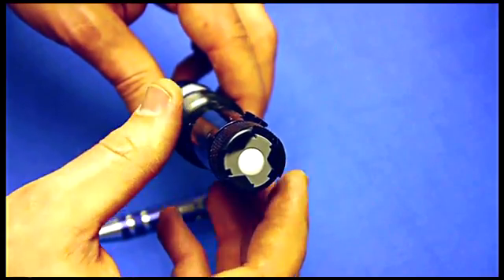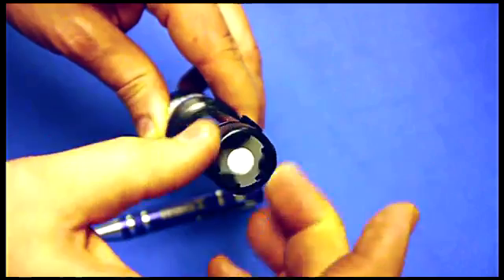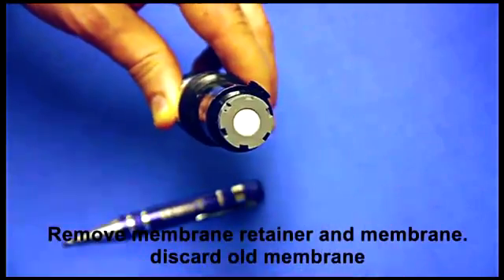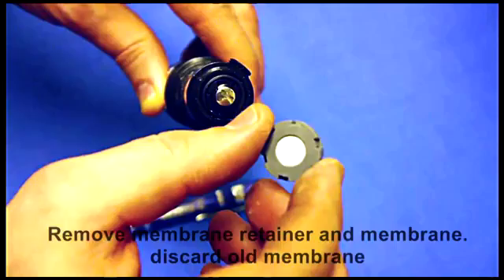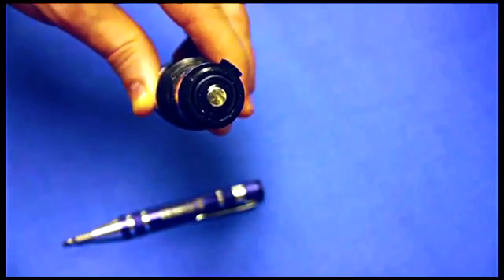So the first thing you want to do is remove the membrane assembly. First take off the membrane retainer, then you can disregard this membrane head and throw that away as it's been used.